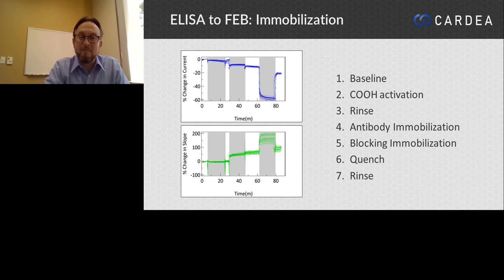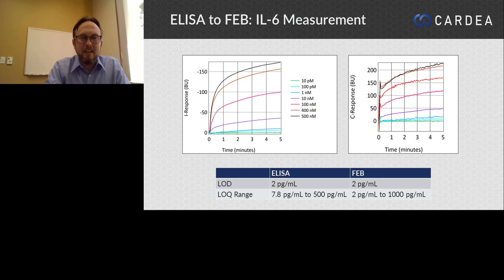And we can vacuum pack those chips and store them and then use them anytime we'd like in the future. This allows us to prep chips for any sort of interaction that we want to measure well ahead of time. In this case, we move on to the measurements. Here's what different concentrations of IL-6, the biomarker we're looking for, do when we put them onto the chip.